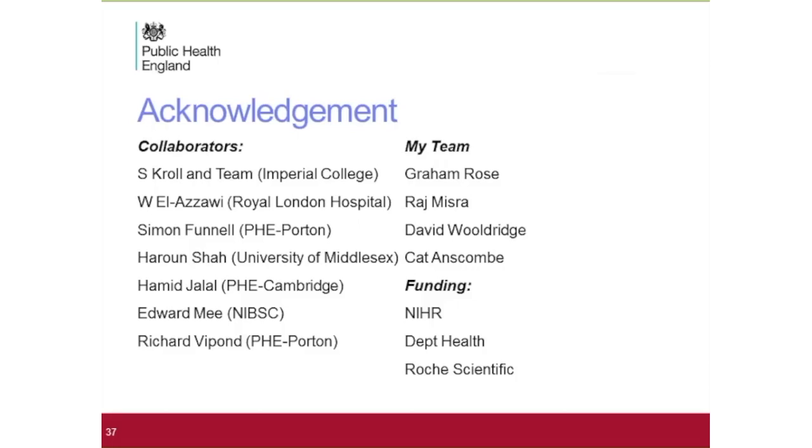You can do them directly by referring back your species allocation to the full whole genome sequence of that organism, a model reference strain of it, and that will give you an indication. But that's a manual process, and you will have to do it for each one of the organisms. But by referring to the paper I've added at the bottom of the slide, you would be able to create that subset and perhaps build it into your analysis.